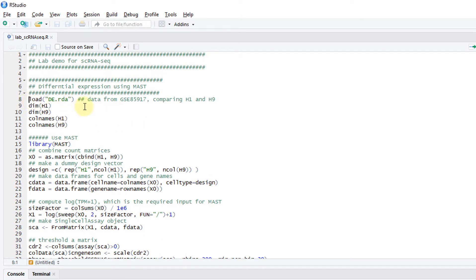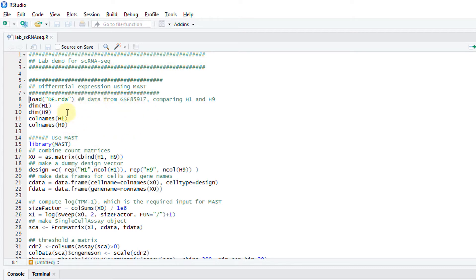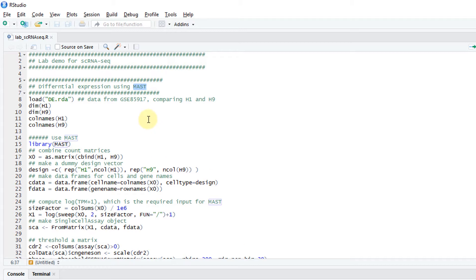Let's first do differential expression. If you open the R file, the scrnaseq.r, the first step is to practice differential expression using MAST. MAST is a software designed for doing differential expression for single cell RNA sequencing.